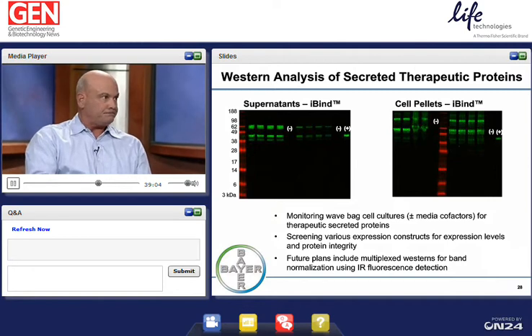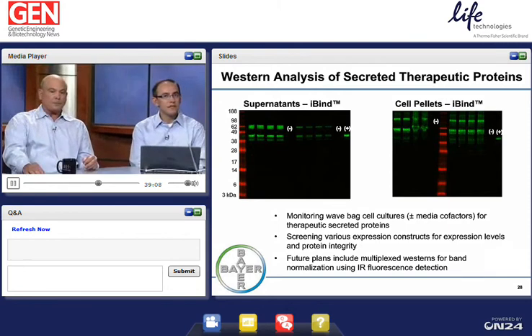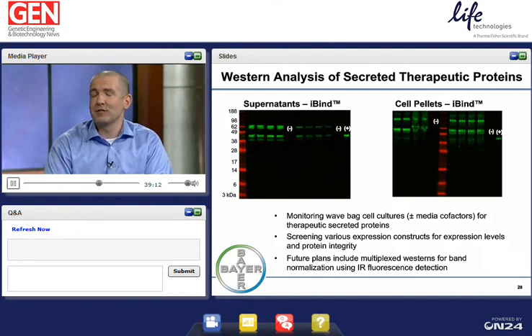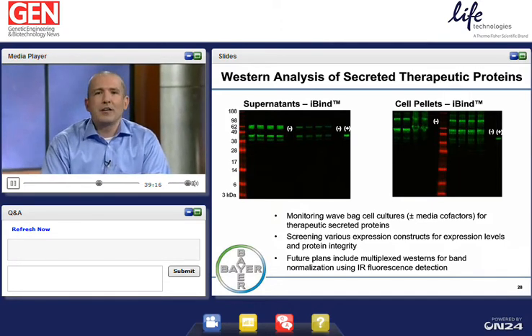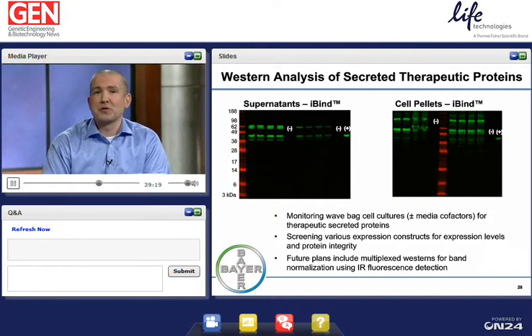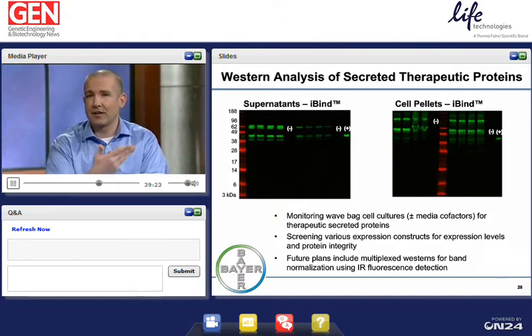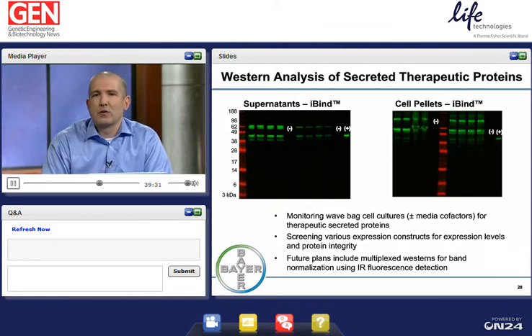Great. This is great, Thomas. I wanted to ask one more question. I see that you mentioned you're using infrared fluorescence detection. I think that's something very exciting moving forward. It looks like you're experimenting with it right now. A lot of people are using multiplexed Westerns now to be able to detect a protein of interest as well as a housekeeping gene. It looks like for this experiment, you were using the red channel with your protein standards. Yes. But is that something that you're going to be using?